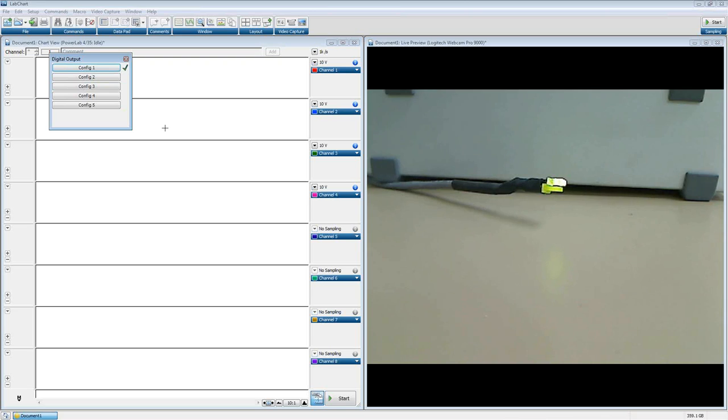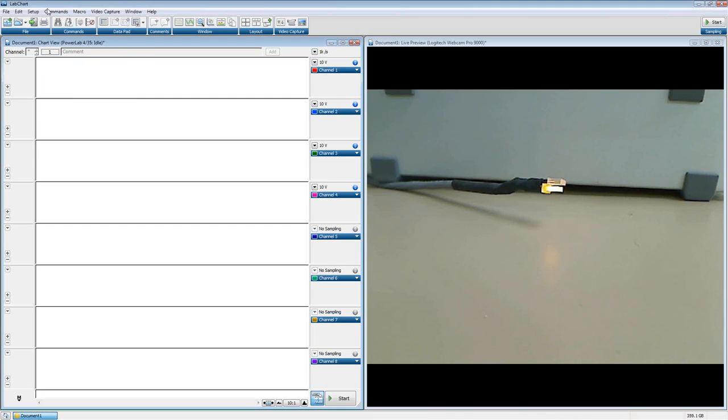I want that manual control. There's ways to automate this that we're going to talk about later on, but this is the most rudimentary use, very simple. Only manually are we controlling anything. It has to be something that the user does here with a mouse click. And I'm left mouse clicking on these buttons here to apply the different configurations. So pretty simple, pretty straightforward.